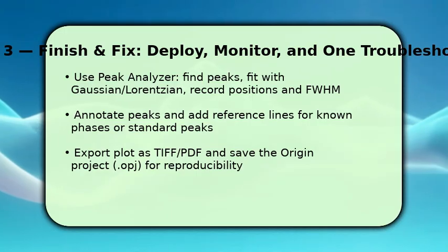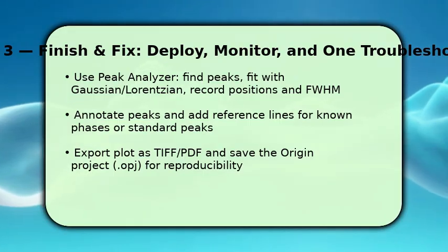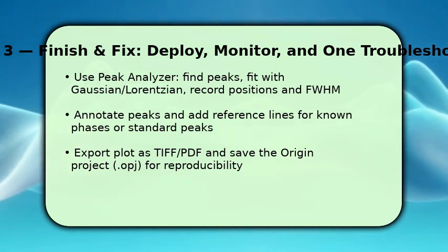Make sure to save the Origin project, OPJ, so all steps are reproducible, and export the figure as TIFF or PDF at 300 dpi for publication. Troubleshooting tip: if fits fail, reevaluate.